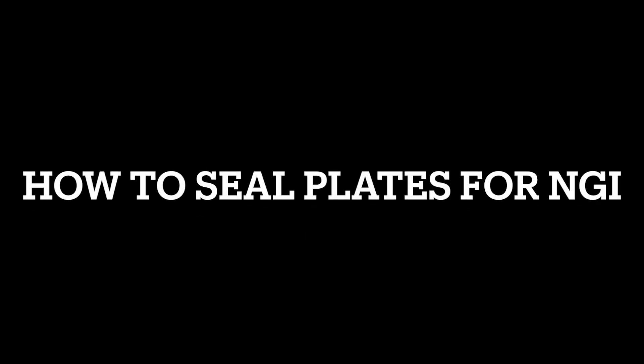Hello! This video will show you how to seal reaction plates with aluminum seals in order to submit samples to the National Genomics Infrastructure. It will also show common issues during plate sealing.